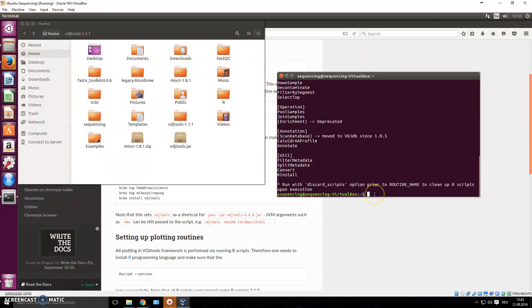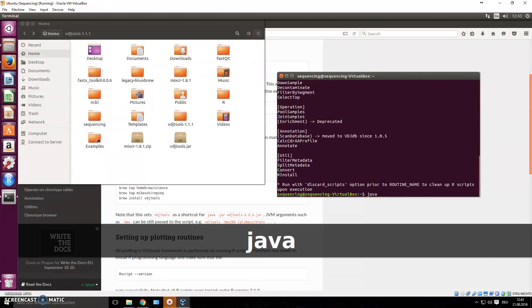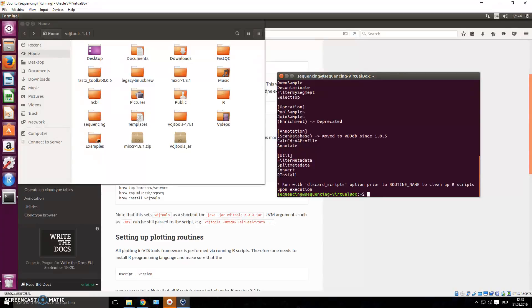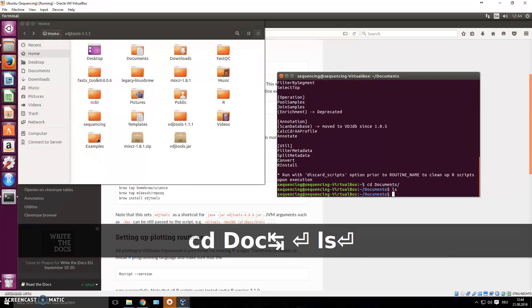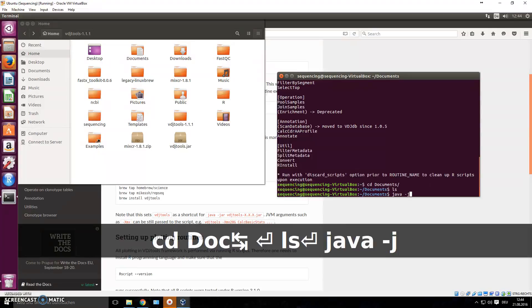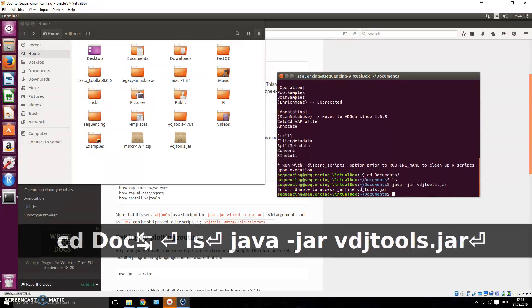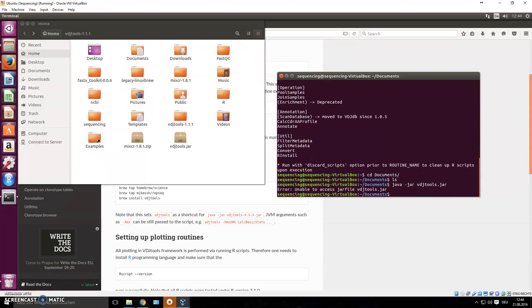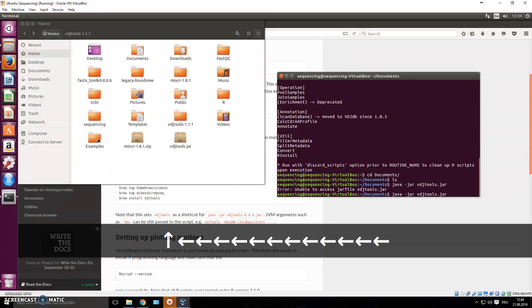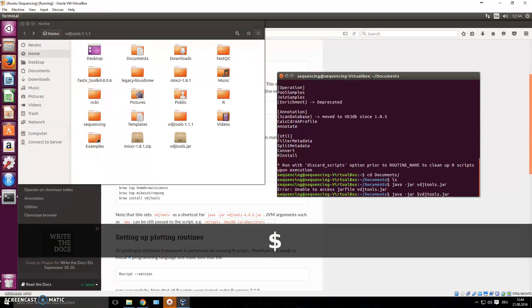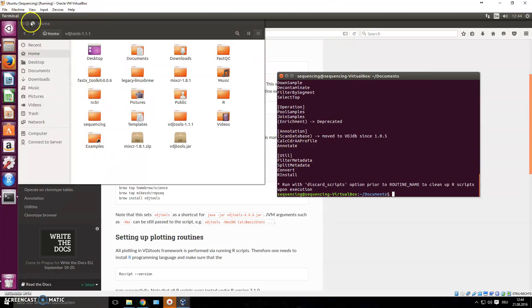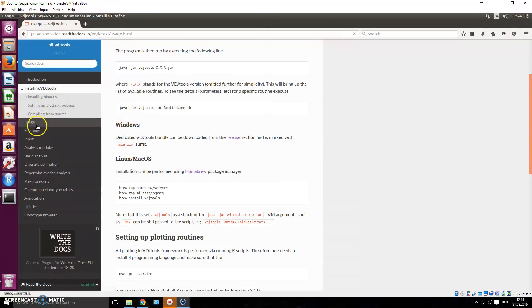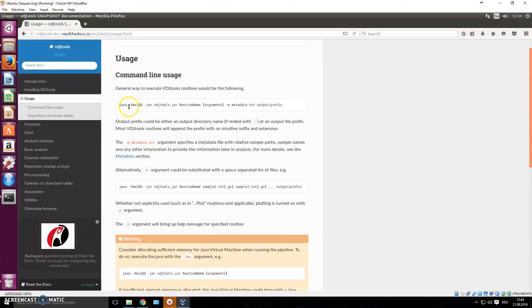If you have the same issue, this is how you solve it. If you do it this way, you'll always have to give the location of the jar. For instance, if we're in Documents and run 'java -jar vdj_tools.jar' it gives the error again. So press arrow up to get the command back, and give the location using the $HOME variable in all capital letters. Now it starts just like normal.